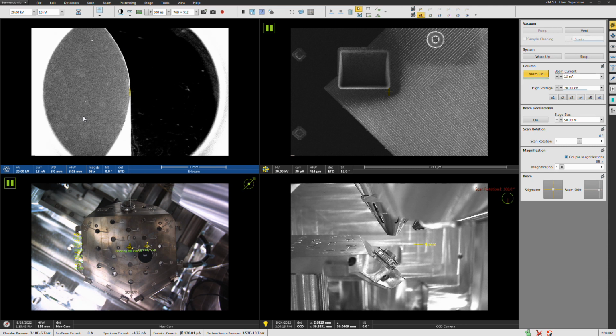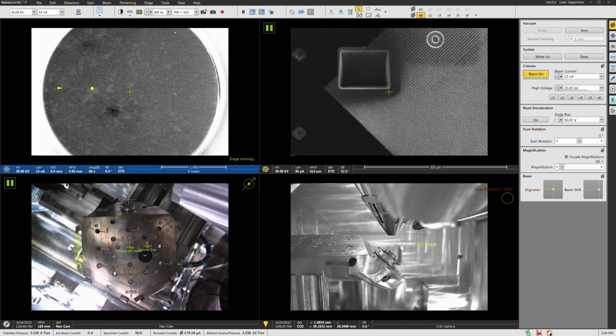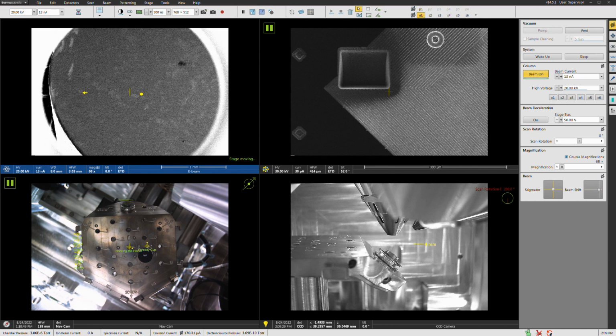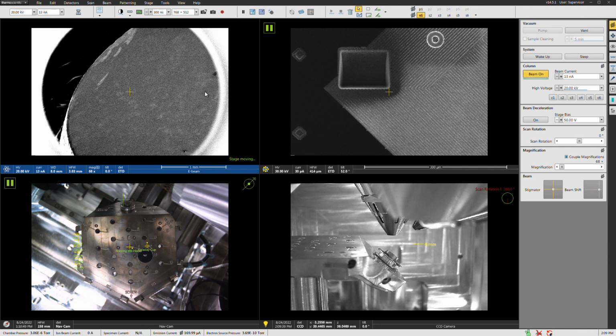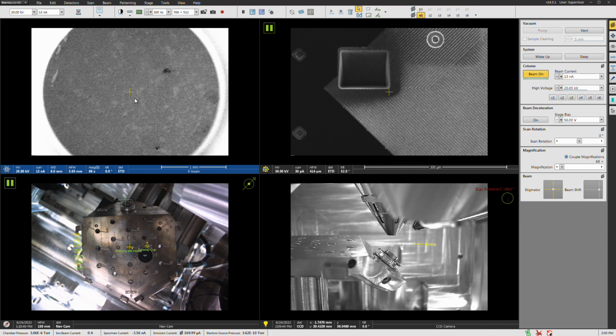Now we don't have to be perfectly in the middle here. In fact, if we move in here, you can see some spots that have some contamination. This piece is actually kind of weird in that it's got some kind of coring to the microstructure. The grains are a lot smaller in the middle than they are on the edge. And actually, we can see right here, and we'll go over here, this hasn't been singed too badly yet.